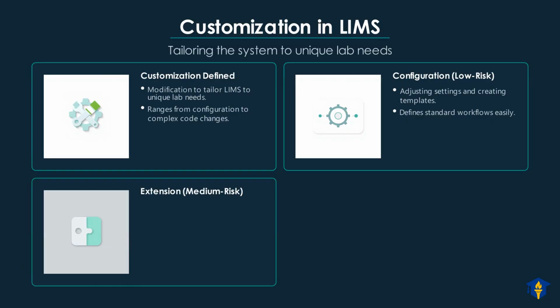Next, we have extension, which carries a medium level of risk for your system. This includes adding custom fields, creating dashboards, and developing user-defined reports for specific data. Extensions enhance system functionality significantly without altering the core LIMS software.